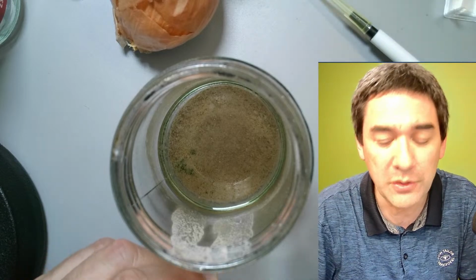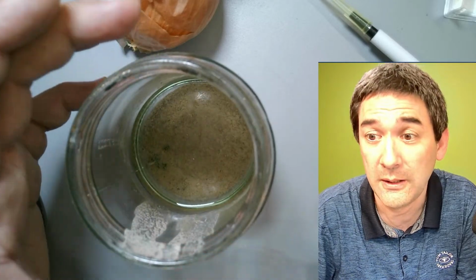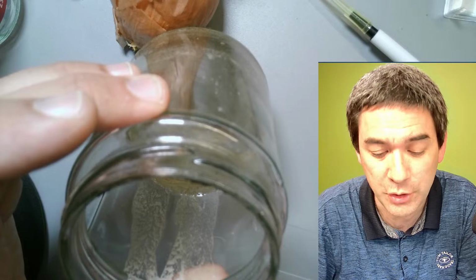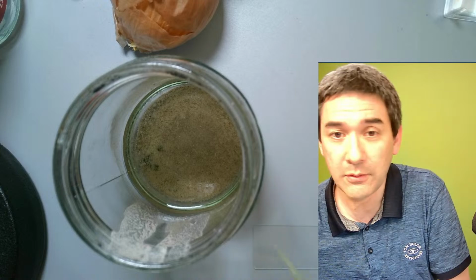So what I'm going to do now is, before I throw out this water sample, I would like to check it. I would like to simply check if there are any diatoms in there, and I need a pipette.